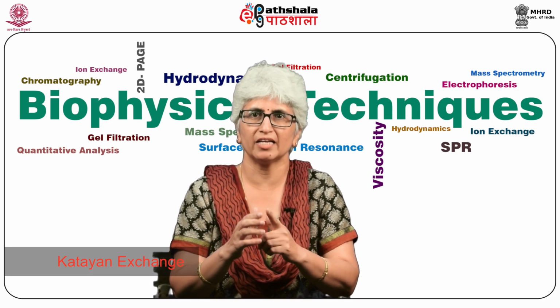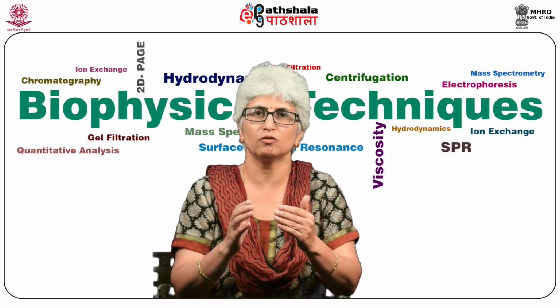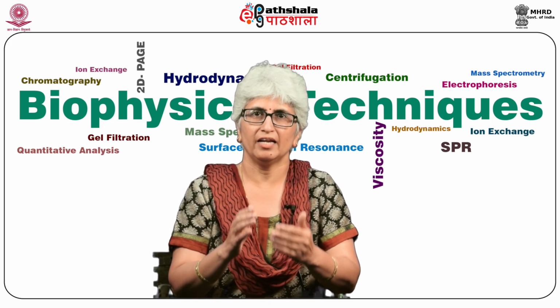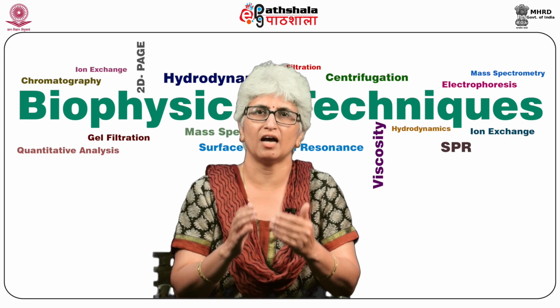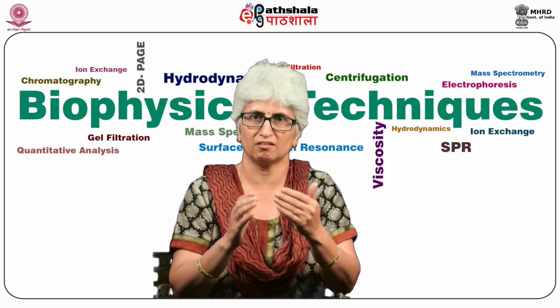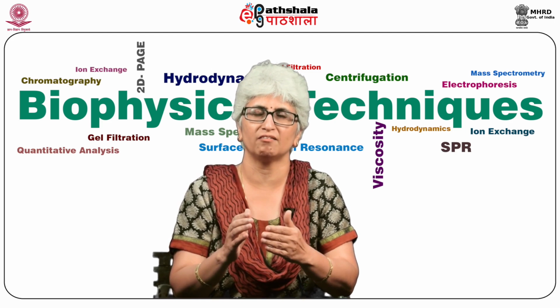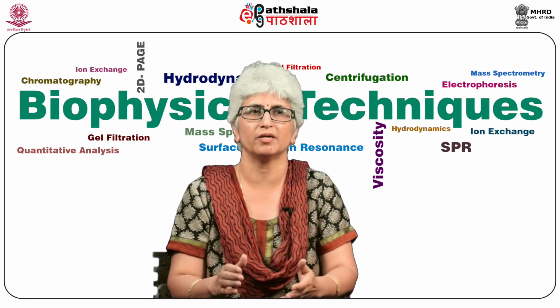In case of cation exchange chromatography, the positively charged analytes are binding to the negatively charged resin. And in case of anion exchange chromatography, negatively charged analytes are binding to positively charged resins. So on the property of charge and charge-charge interaction, the proteins or any other compounds can be separated by ion exchange chromatography.